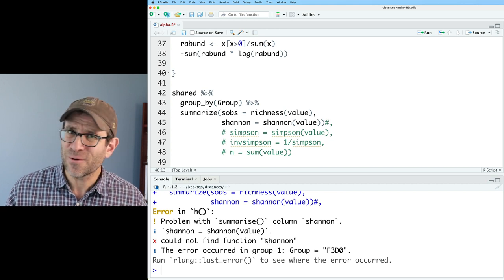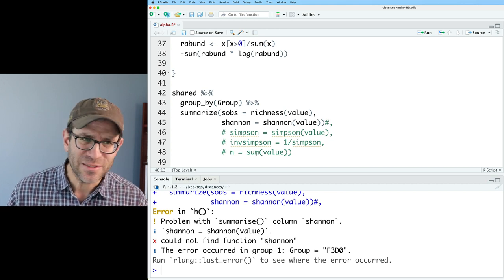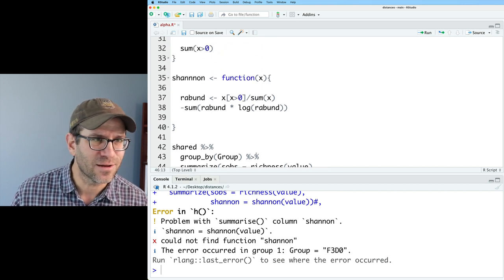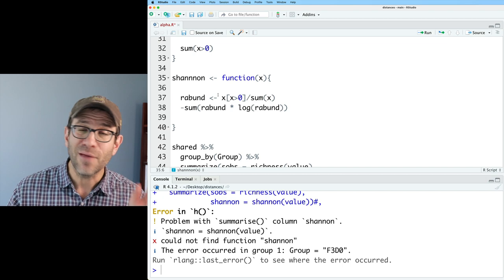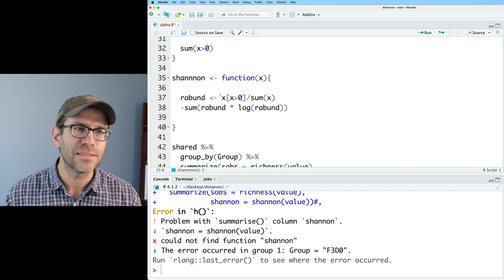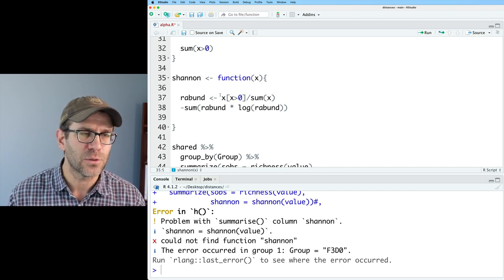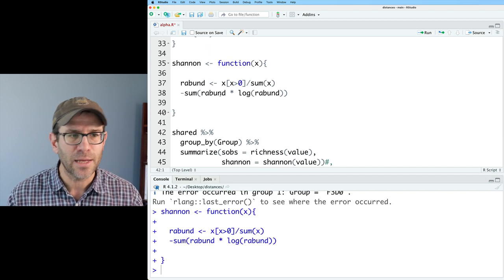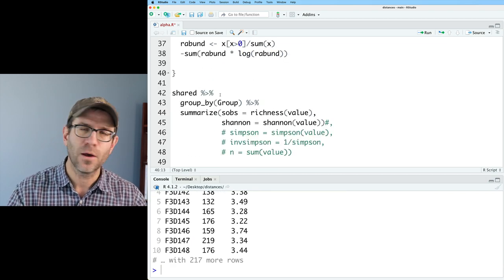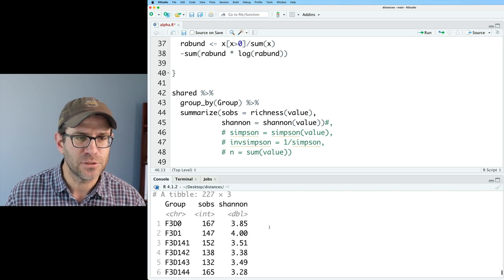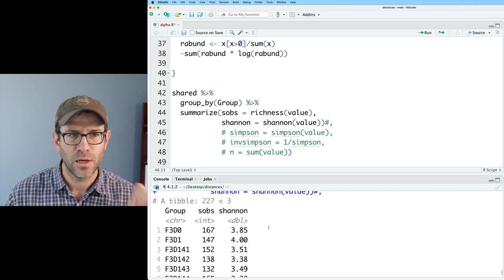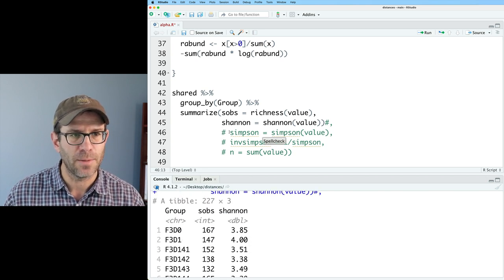So I'm going to double check by coming back up here and reloading the function and then running this again. And it says still couldn't find that function. I know it's loaded. So let me take a closer look. And sure enough, I've got three n's in there for Shannon. So I'll go ahead and reload that, rerun the code. And now I get my Shannon diversity values in here and we're in good shape.